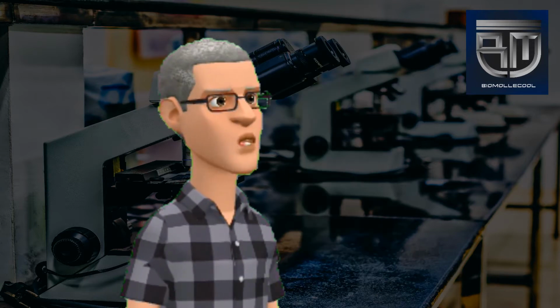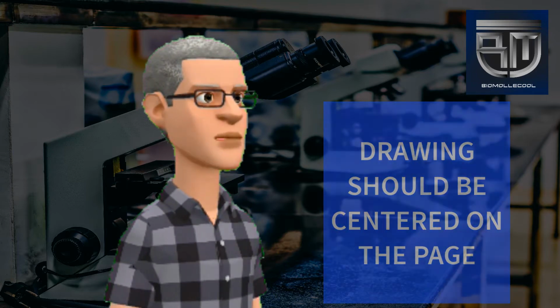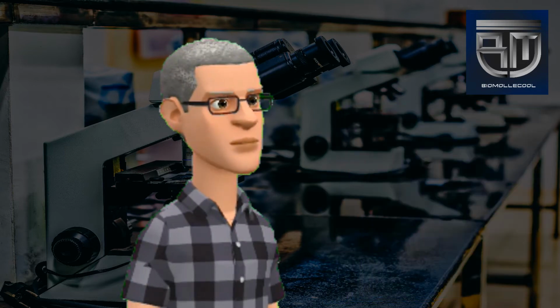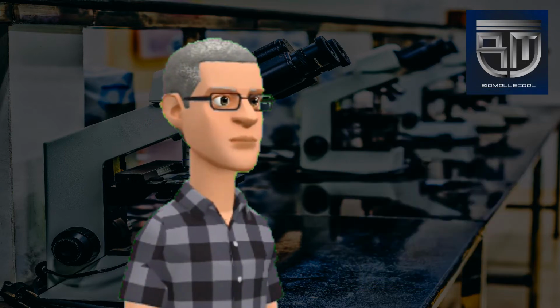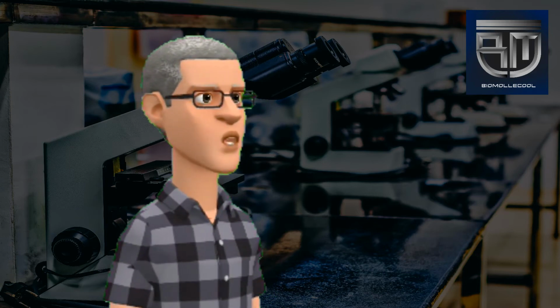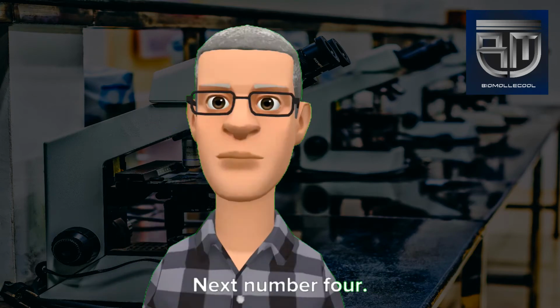Second, your drawing, your diagram should be centered on the page, not elsewhere on the paper. Third, your drawing should be large enough to represent every detail you see under the microscope. You don't have to draw everything. A small cross-section will often suffice.